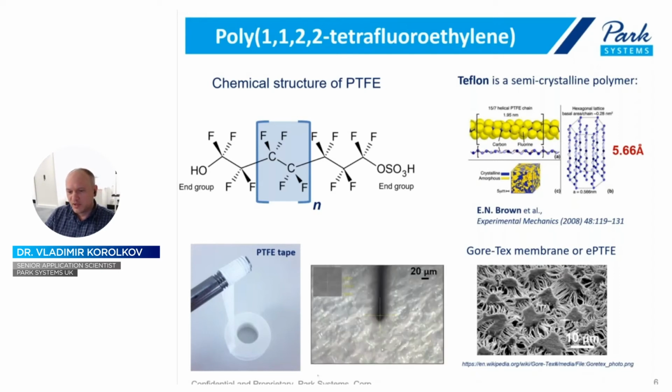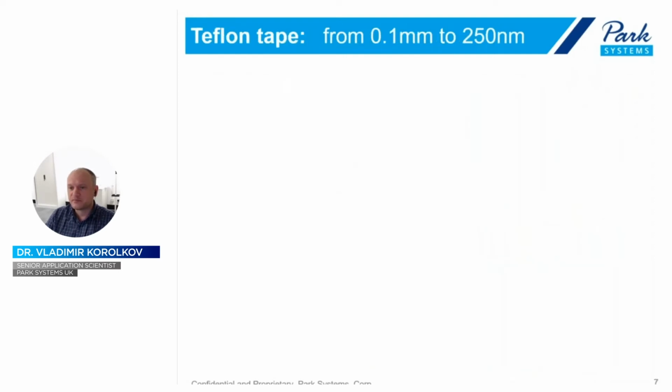Right, before we go, that's an optical image that you can always collect, and I always advise people to collect an optical image of your sample to get an idea where you took a scan and what your sample looks like on a sort of large scale. It's always a very good idea to do that. And Park NX20 provides you with a high-resolution camera, and you can get very nice images from your sample, like with a regular optical microscope, and that's a great thing to have.